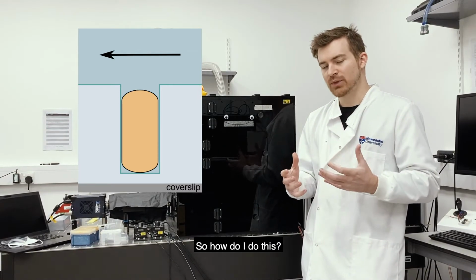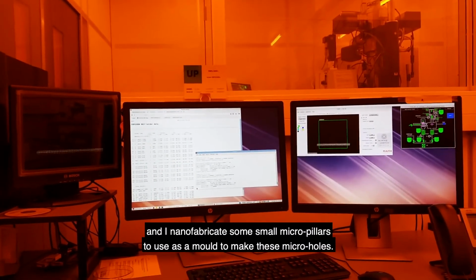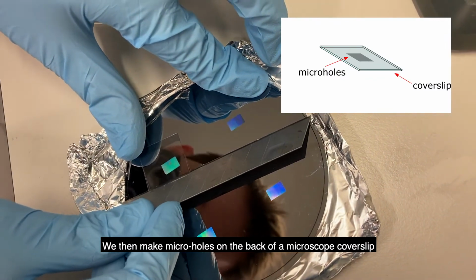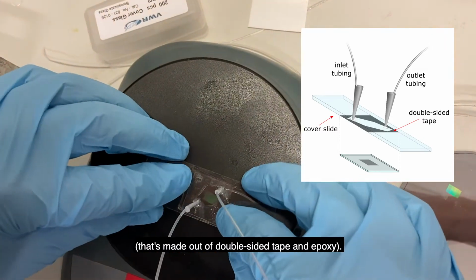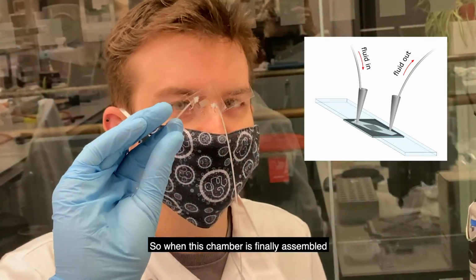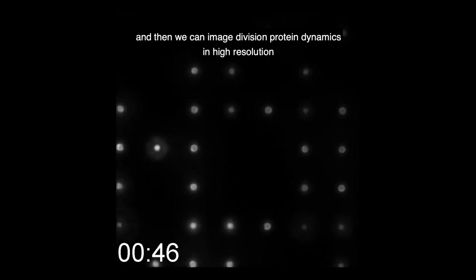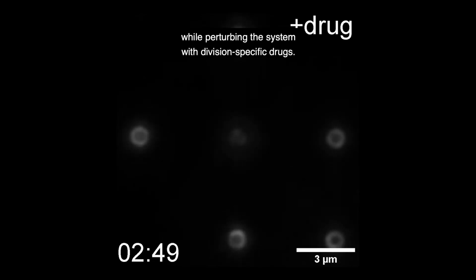So how do I do this? Well, I put on my bunny suit, I go to a clean room, and I nanofabricate some small micro pillars to use as a mold to make these micro holes. We then make the micro holes on the back of a microscope cover slip and then confine the entire thing in a sophisticated microfluidic chamber that's made out of double-sided tape and epoxy. And so when this chamber is finally assembled, we have the cells in there and we put them in the microscope. And then we can image division protein dynamics in high resolution while perturbing the system with division-specific drugs.